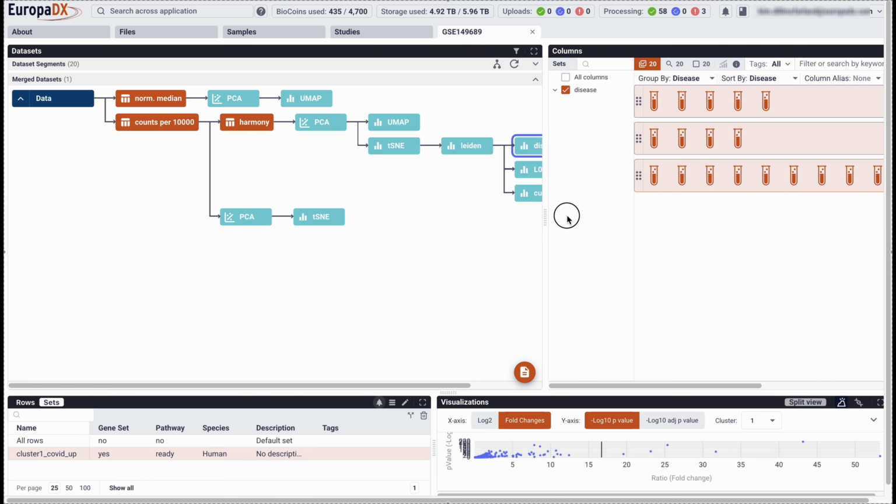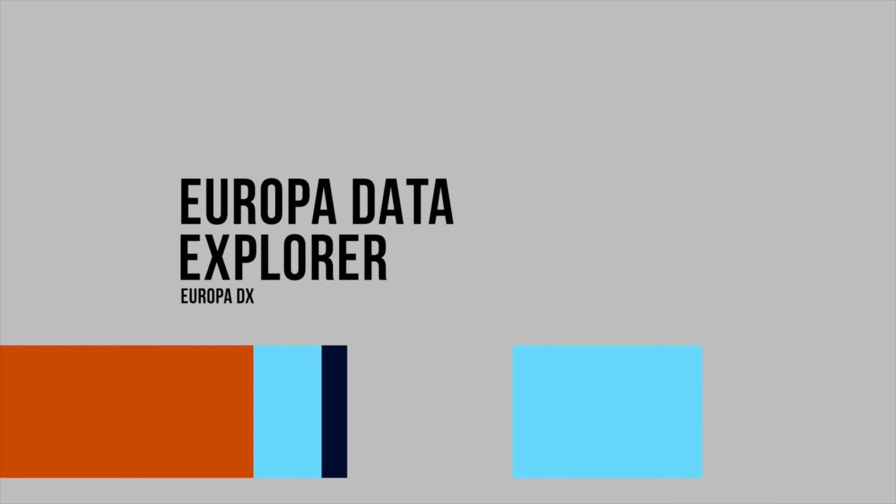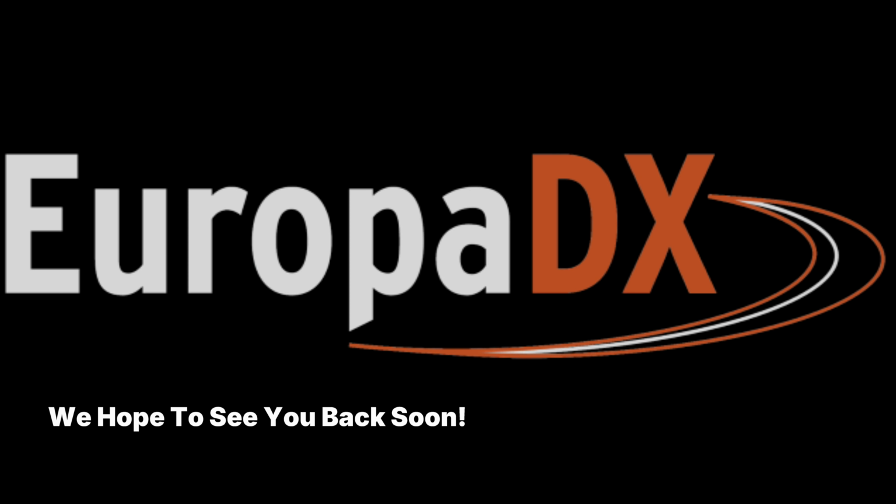And there we have it, a complete single-cell RNA-Seq analysis including QC, normalization, clustering, annotation, DEGs, and pathways. We hope you enjoy analyzing your data in the Europa Data Explorer soon.